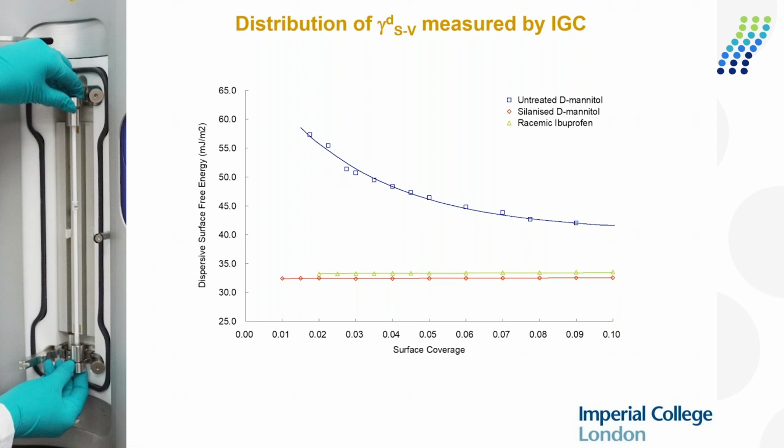So potentially you've got to go to a slightly larger chlorinated hydrocarbon, maybe chloroform, maybe a dichloro or tetrachloroethane, something like that. But you need a larger molecular weight with a higher boiling point that will absorb more strongly. I think something like tetrachloroethane might work as well. So basically bigger molecules.